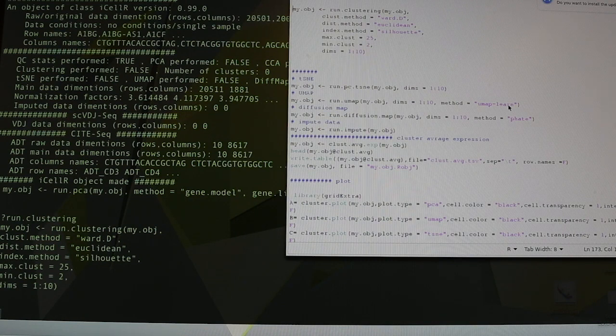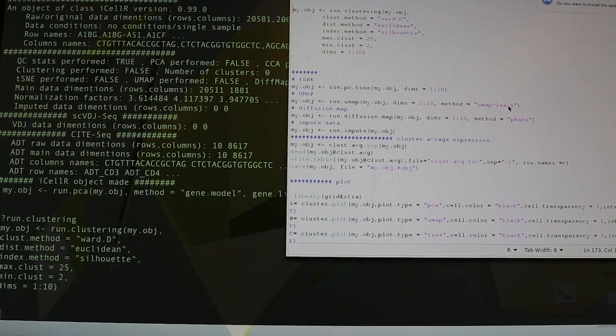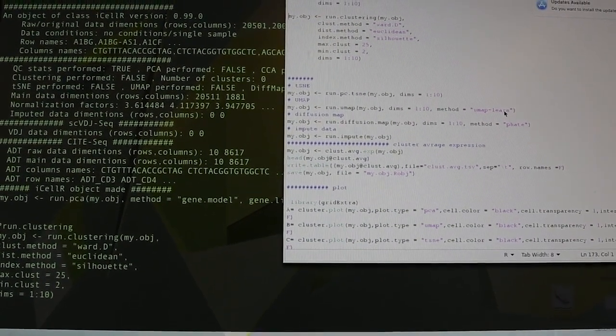So this is practically what yours is. Yeah, I've done it this way every time. It works so much better than the other way. So without normalizing to something like a hashtag antibody, that's considered to be a constant? The hashtagging is already done, so we just have the cells and the conditions. As a normalizing concept, if you want numbers, it makes more sense to look at something that's working with the antibody and use that.